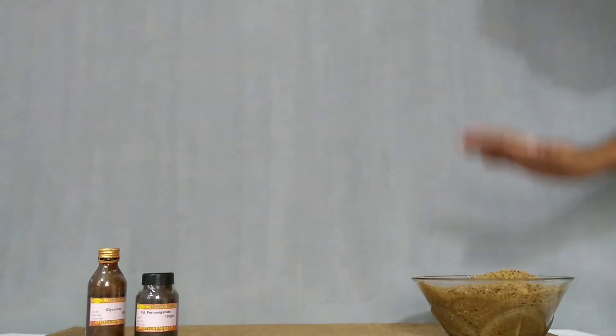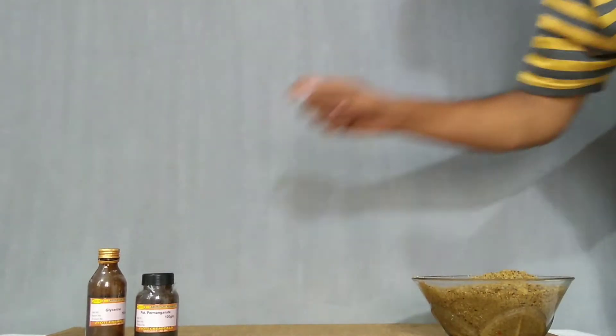To build a volcano we need wet sand, glycerin, and potassium permanganate.